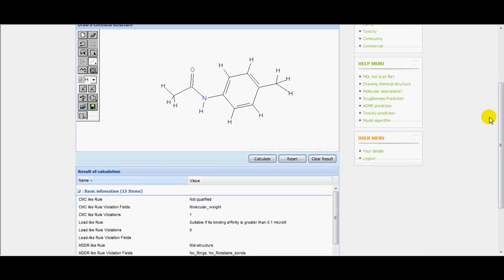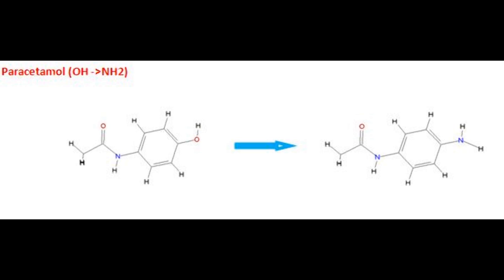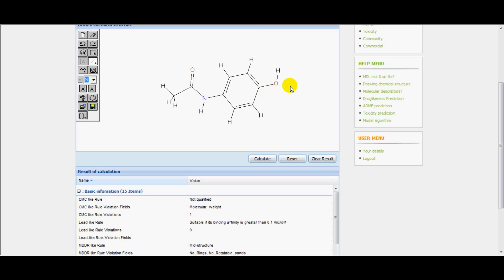Again we are editing the paracetamol OH group with NH2 group. Click to calculate. Here the CMC-like rule, lead-like rule and MDDR-like rule have violations. Copy the result to the document.